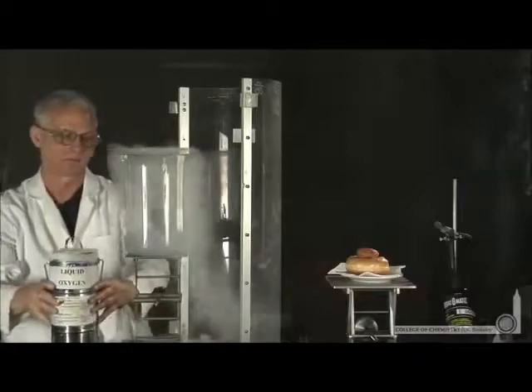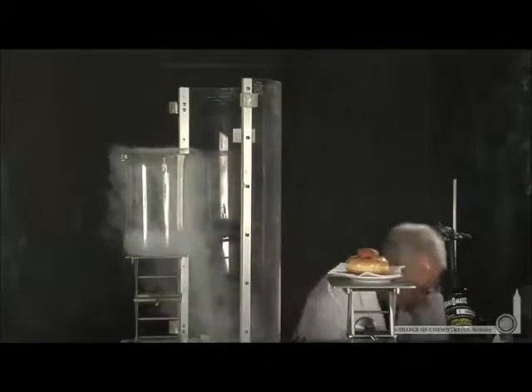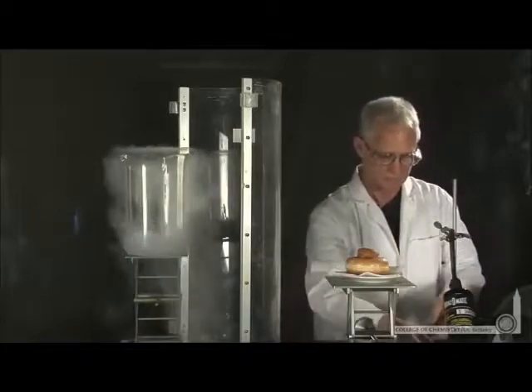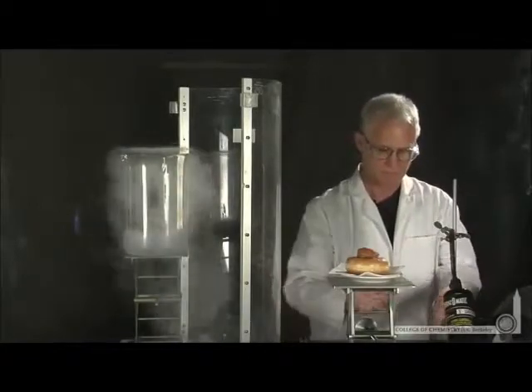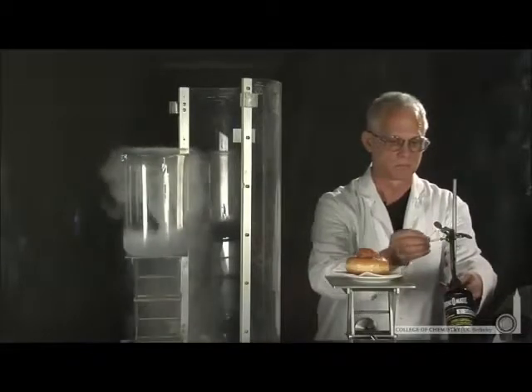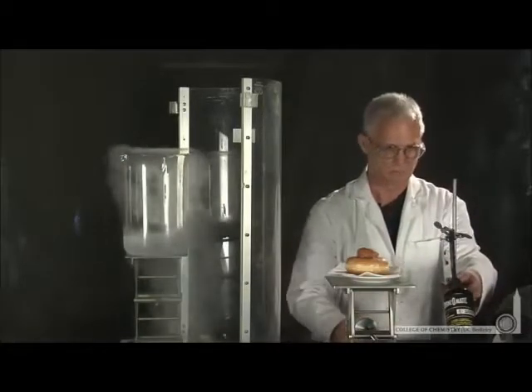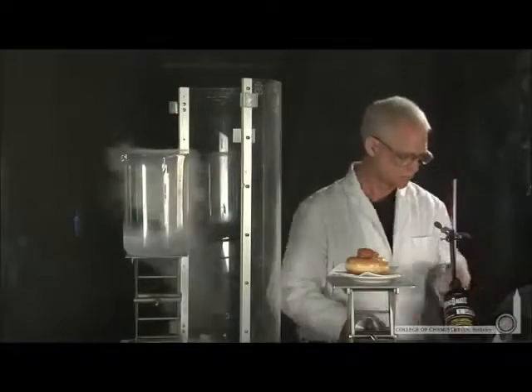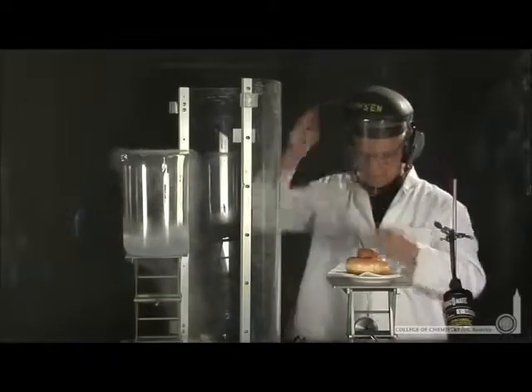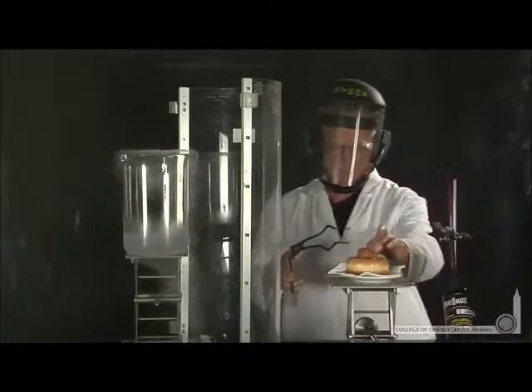Now, this isn't a formal calorimetry experiment because we won't capture all the heat released, but we'll just visually demonstrate the amount of energy stored in a bite of donut. So to start this reaction, Lonnie will start the donut burning in oxygen and then add it to the liquid oxygen so it rapidly combusts and we'll see the energy released rapidly.